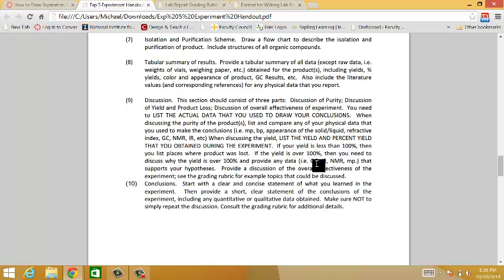Well, there is a certain pattern of GC that tells me the product is wet, and I don't think I wrote that, but if you're concerned, I can tell you what your GC would have looked like. But let's not even go that far. Let's say dichloromethane. In the GC, you'll actually see a peak corresponding to dichloromethane. So if you say, well, my product contains some dichloromethane, in the GC you can see this peak, therefore that might be one of the reasons why it's over 100%. Great.